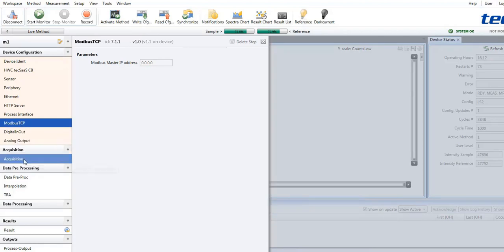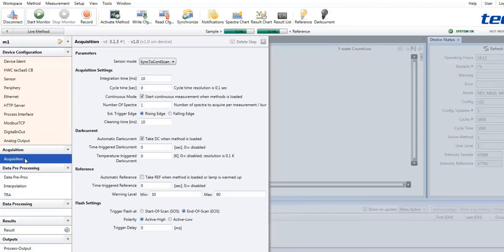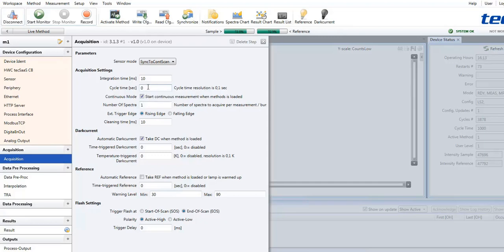As a next method step, you may define your acquisition with the data acquisition settings for the spectral sensor. This includes a mode of operation, internally or externally triggered modes are available, an integration time, a cycle time which defines the interval between measurements, and a few more.